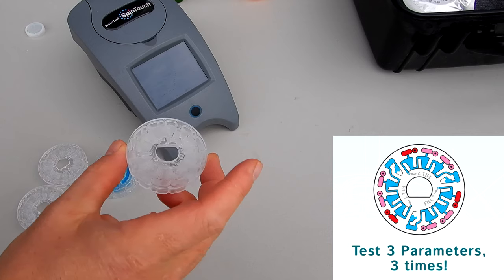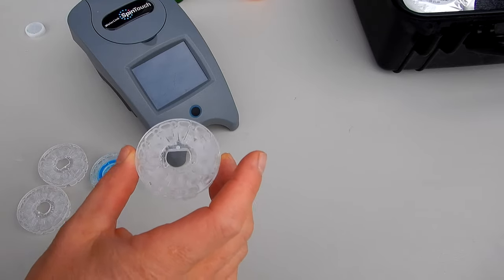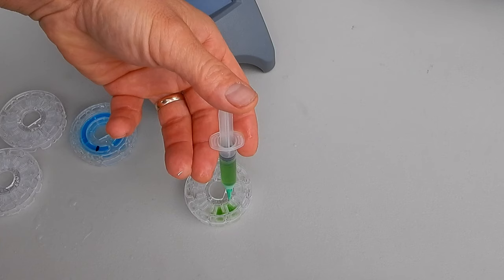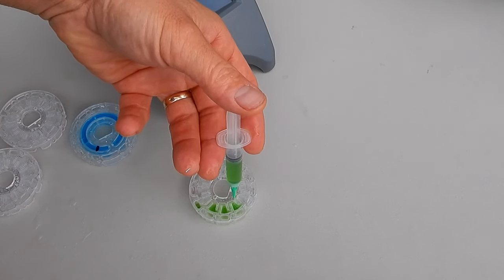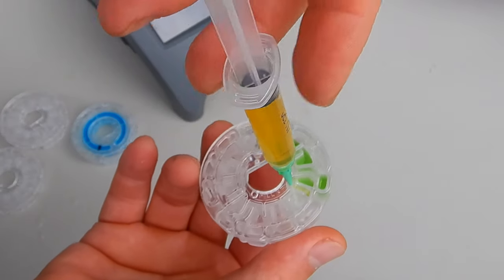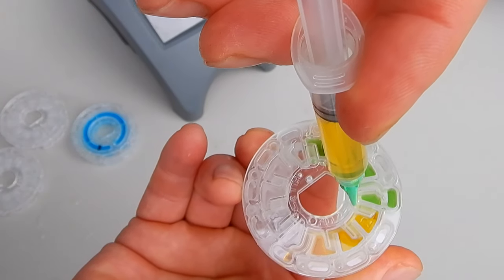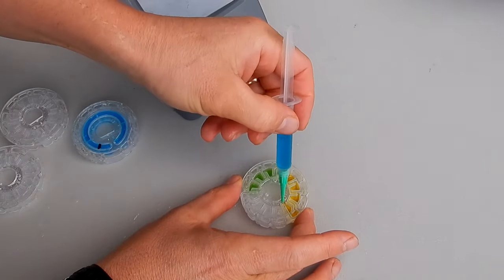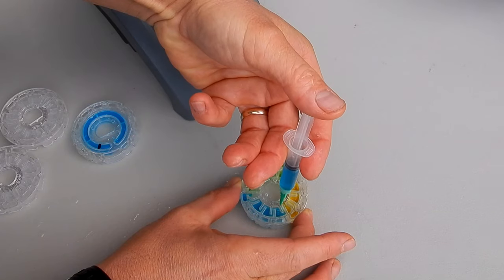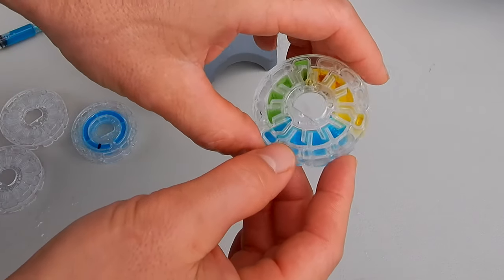Now I'm going to show you how to fill the three-disc 501 and 601 series disc. I'll fill up all three chambers so you get an idea of how this will look. I'm going to slowly push down and you can see it filling up. And here's the third chamber. Now I have all three chambers filled in the three-disc set.